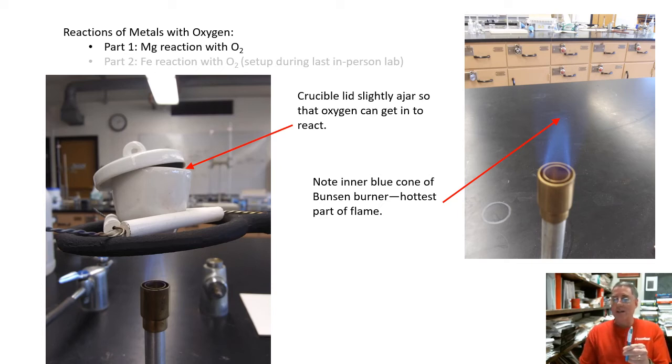What we don't want to have you do is turn on the gas and then fumble around with lighting the match, and then you're just adding gas. And there's not going to be a problem, but it just stinks, and it fills up the lab with gas. So what you do is you light your match, and then you turn on the gas and take the match and bring it up from the side of the Bunsen burner.